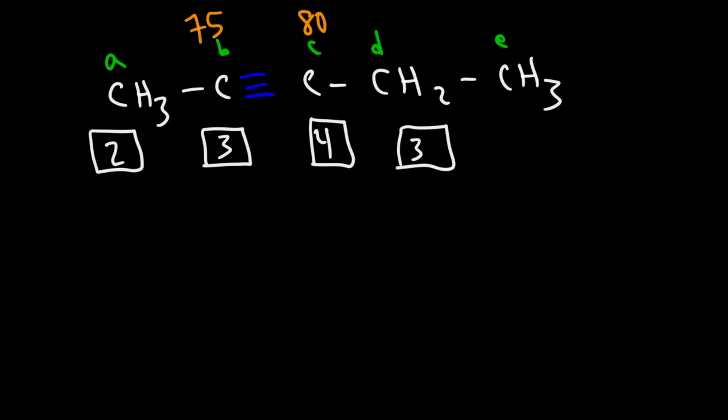It turns out that the chemical shift of the methyl group on carbon A is 3, just like in the case of 2-butyne. But the methylene group, corresponding to carbon D, has a chemical shift of 13. And so we can see that when everything else is equal, the one with the higher score value usually has the higher chemical shift.